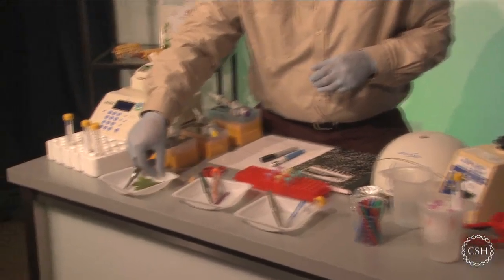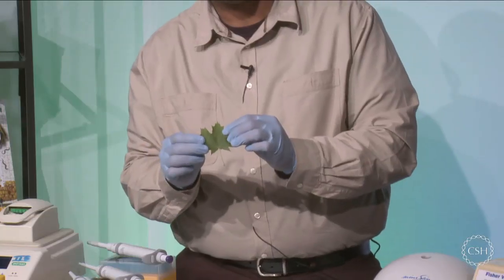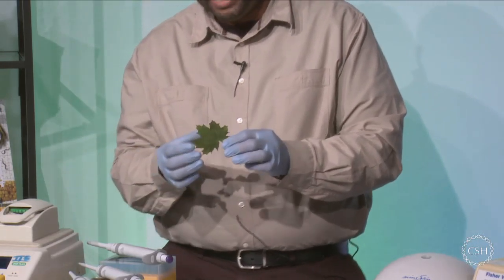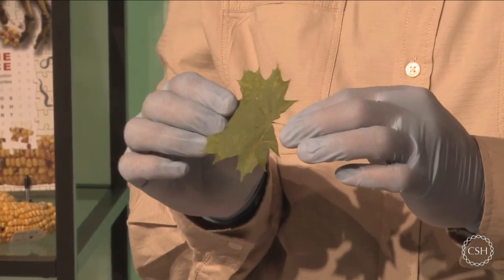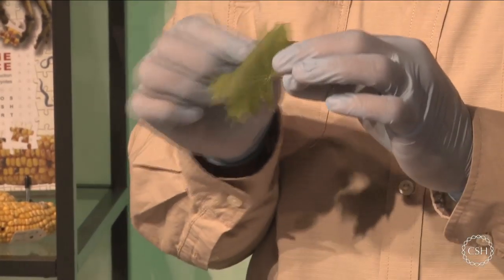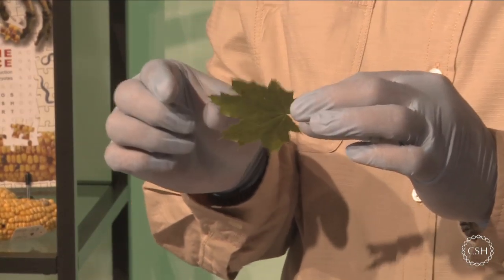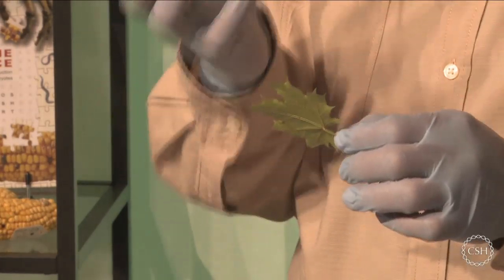What you see here is just a leaf from a tree that I plucked outside. You can see that it's not very shiny, and this actually is a really good plant to pull from. If you see something that's really shiny, it might have a lot of carbohydrates or things like polyphenols, which are contaminants. It may make this a little bit tougher or harder to physically work with. So you're going to be mindful that you might want to do a little bit harder crushing when you have a more rough plant.